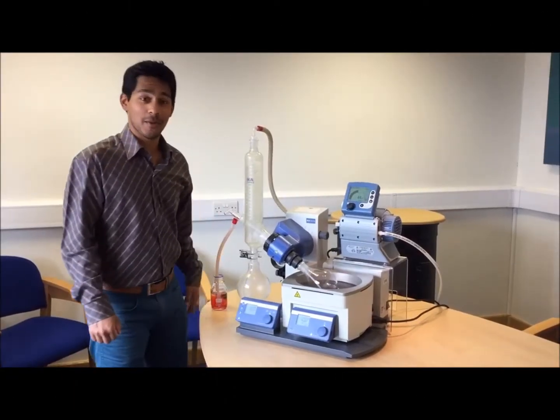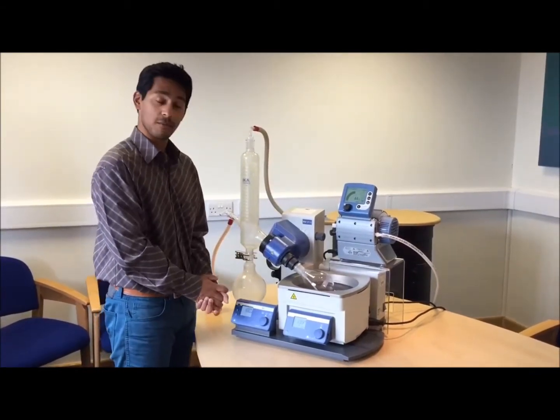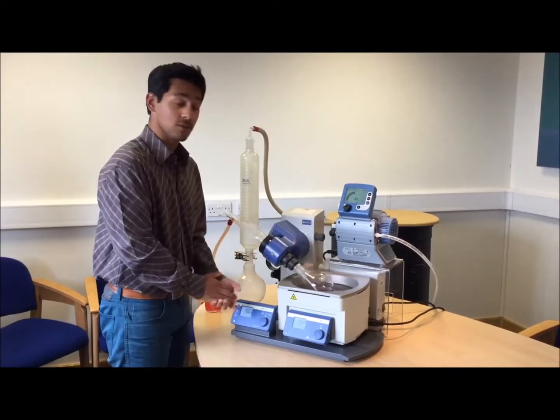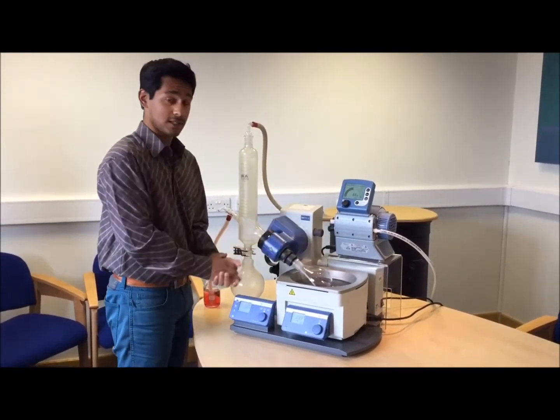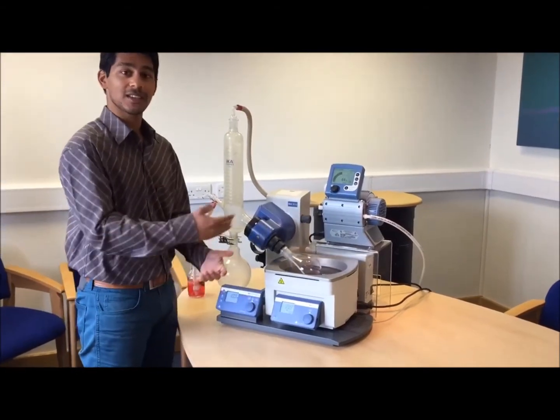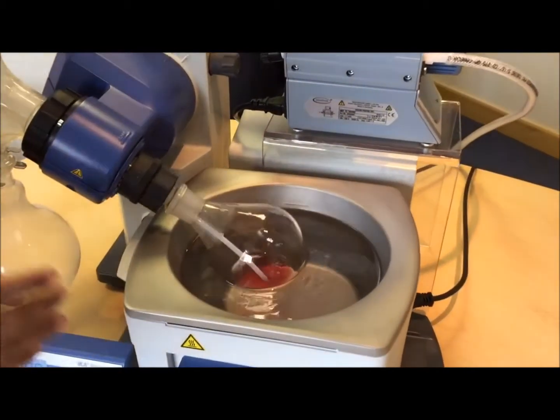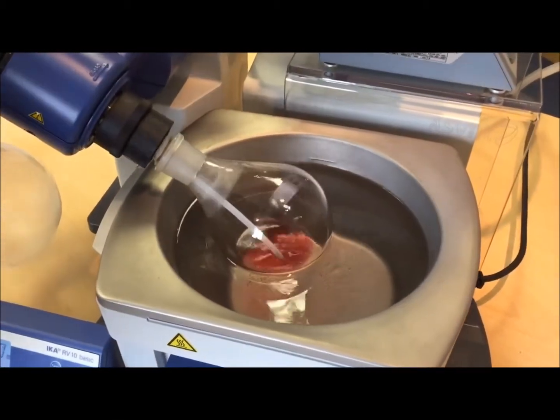Hi everybody. On the topic of evaporation, here I've got our premier evaporation setup consisting of an IKA RV 10 rotary evaporator and the VacuBrand MD1C Vario fully automatic pump. Here I'm going to show you a slightly less used but really interesting feature of our rotary evaporator for continuous evaporation.